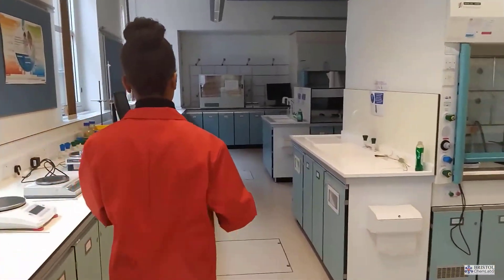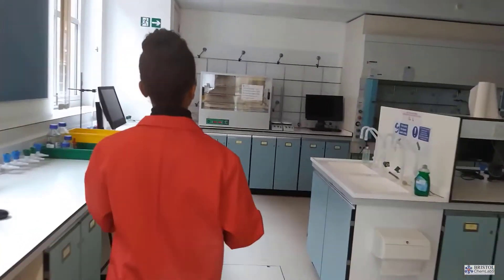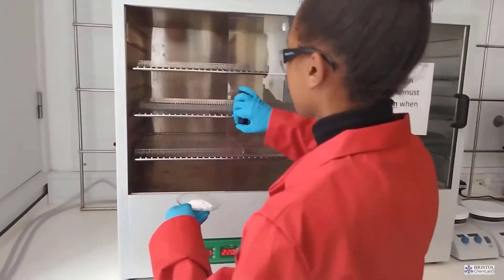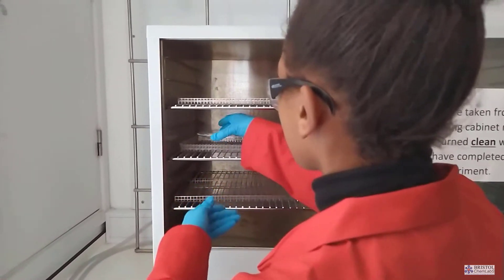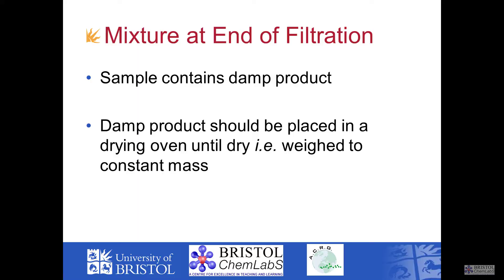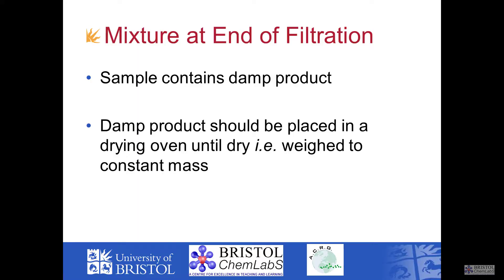Of course if you wanted to ensure it was dry you'd weigh this damp sample beforehand, put it into the drying cabinet and weigh it periodically until the mass no longer decreases. We dry to constant mass. The next step is some analysis of our product.